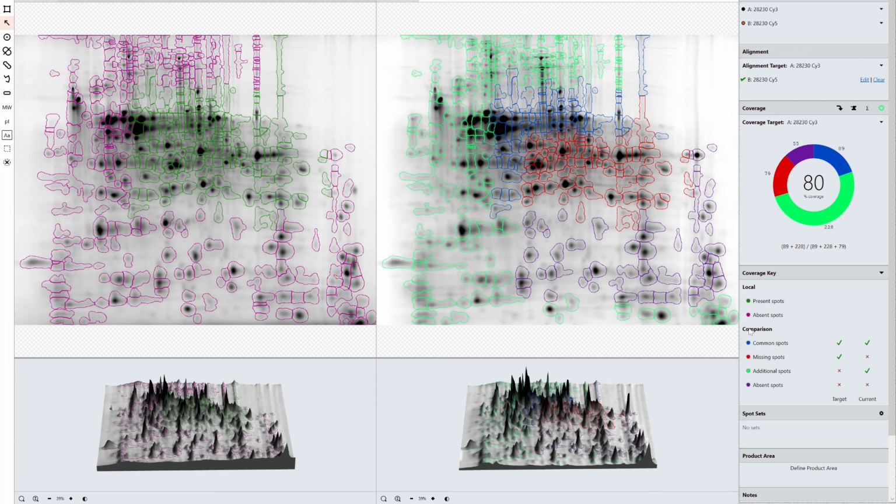The Data Access tool is exactly what it sounds like. It allows you to access all the data from within the experiment, and it's where our reports are built from. So if you want to use the internal reporting function that SpotMap has, which is an export to PDF, by all means you can use that, and that's built up using the Data Access tool. So users have a great amount of flexibility as to what's included within their reports.